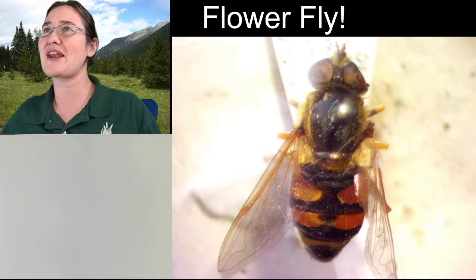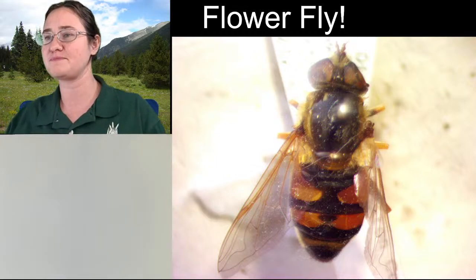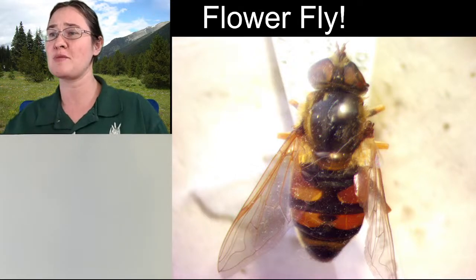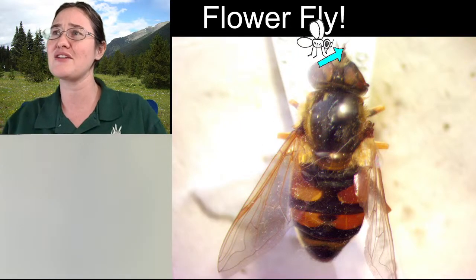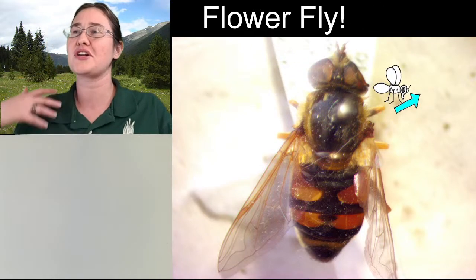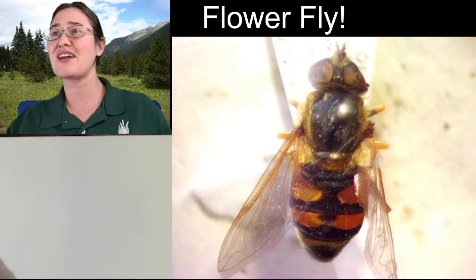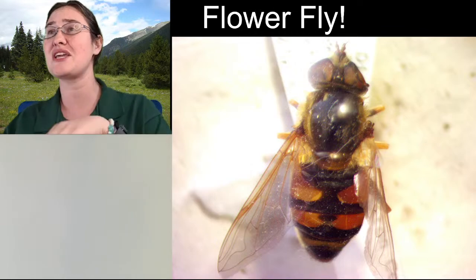So we're looking at a flower fly here, and when we are looking at flower flies, especially out there that are kind of hovering around the flowers, the big characteristic that will help you determine whether it's a fly or whether it's a bee or a wasp is the antenna. So flower flies have these little short stubby antenna, and wasps and bees are generally going to have longer straight antenna or longer elbowed antenna. And when we get a close-up look at the flower fly's head, we're going to be able to see that they have very unique antenna, and many flies have this type of antenna, but it's unique to just that order.